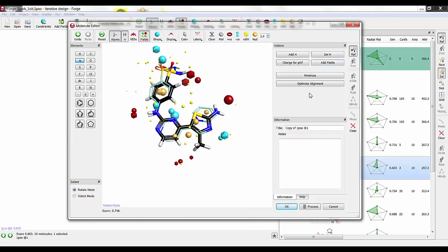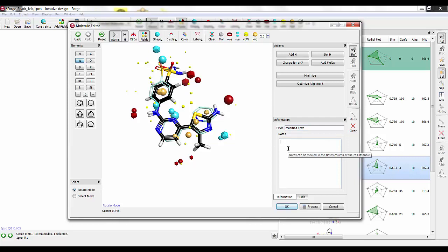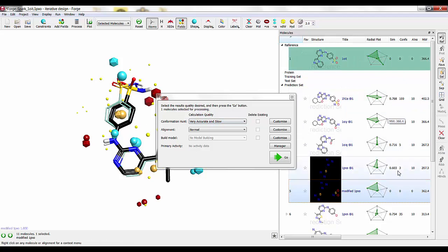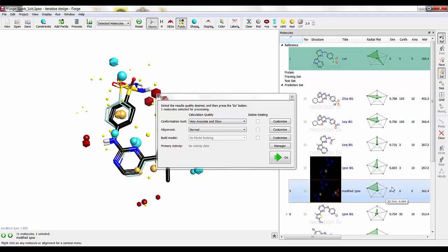Now what I can do here is I can make some notes. We can say 'modified 1PXO,' and I can make some notes that this was an iterative design project. I can click OK to keep it, but the first thing we want to do is process it. We want to process this one molecule with the same conditions that we used for all the other molecules in our molecule table. You'll see that this shows up and we have an alignment score of zero, which means it hasn't been done yet.